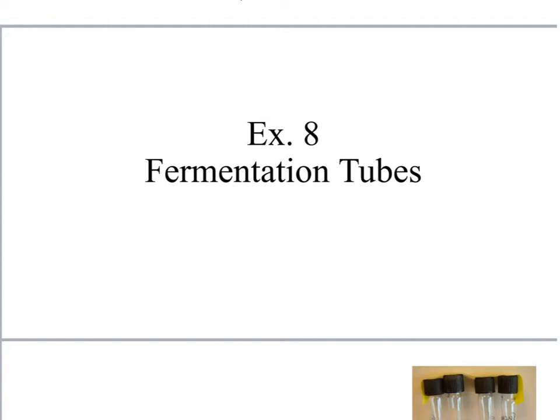Okay, in this lab, we're going to be focusing on metabolism, and we are just doing the fermentation tubes in exercise 8. We're going to skip over those oxidation reduction tubes, OF tubes.